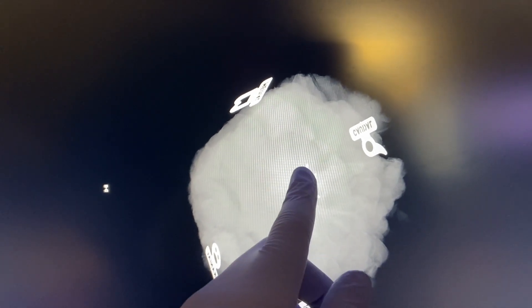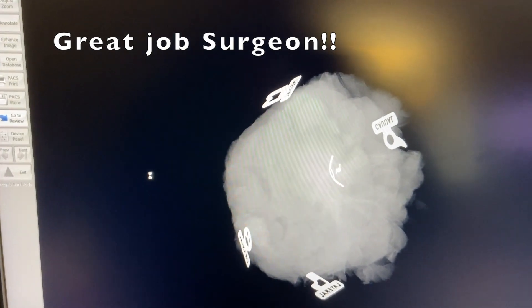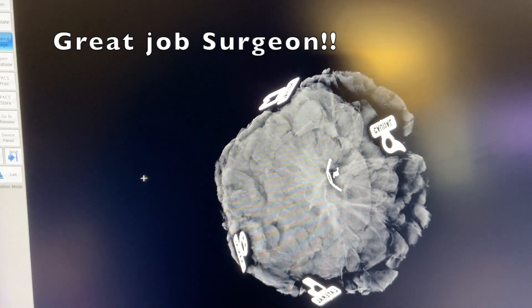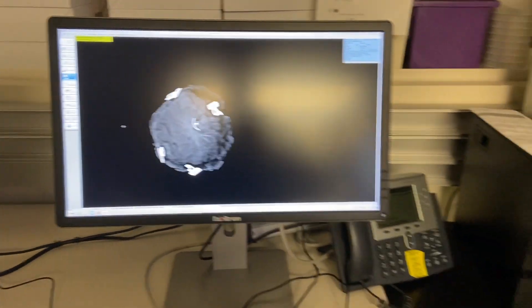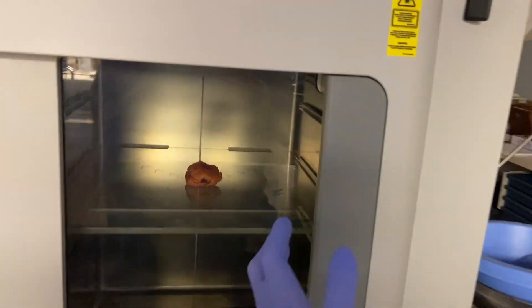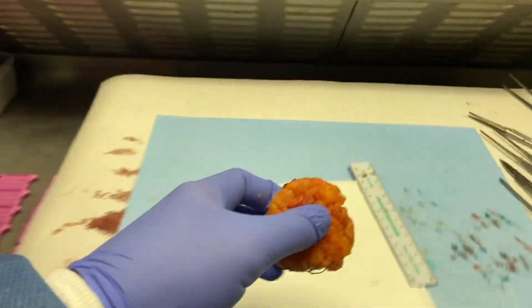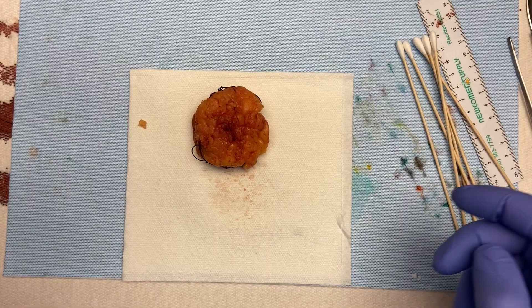We have what looks like a Savi Scout radar reflector and a two-mark high-shape clip sitting right next to this spiculated mass in the middle of the specimen. I'll review this image first before ever cutting the specimen to get a good idea of what we've got, and then we'll go back and do our inking before cutting.